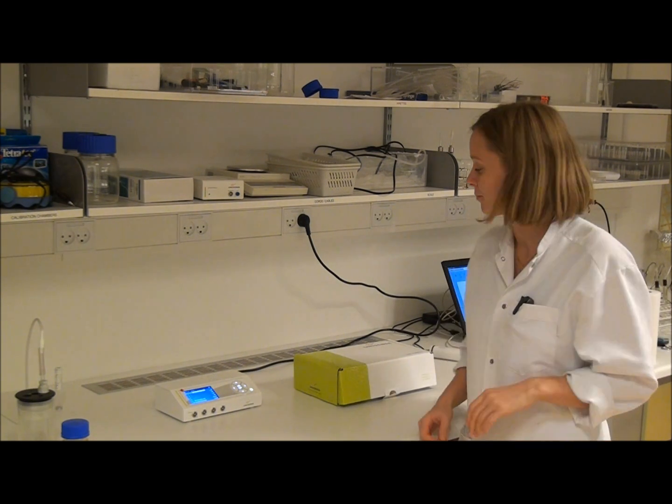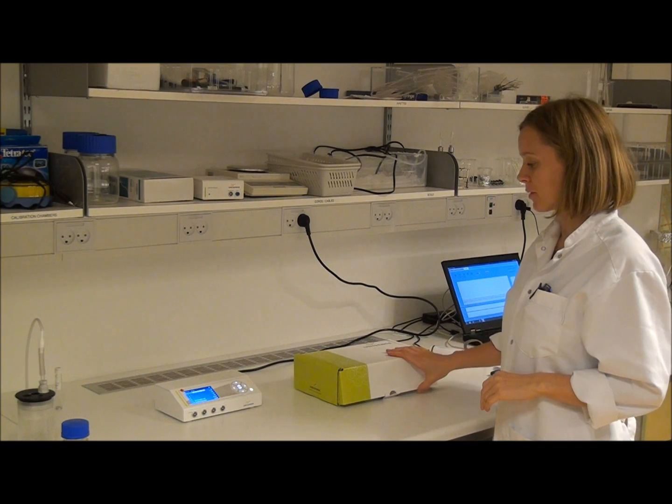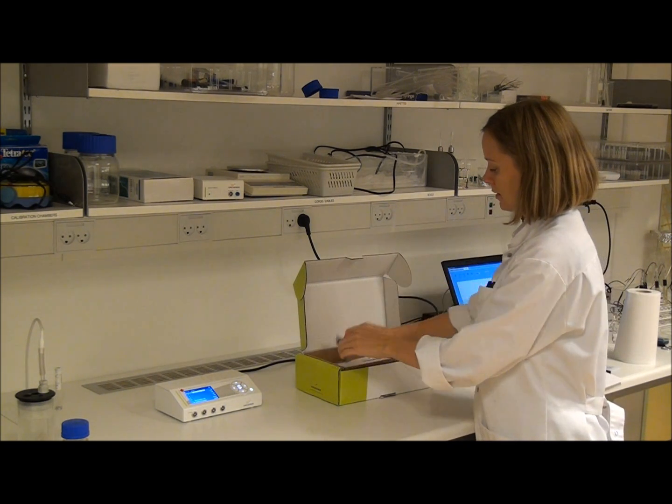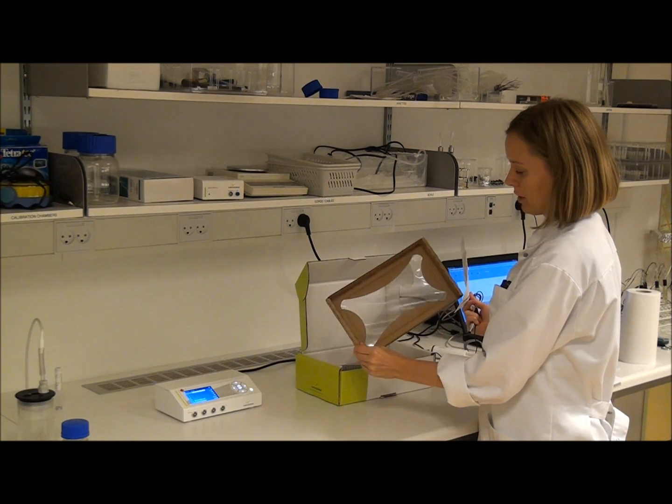In this video I will show you how to test your new oxygen sensor. You will receive the sensor in a box like this, and inside the box the sensor is protected by two plastic membranes.